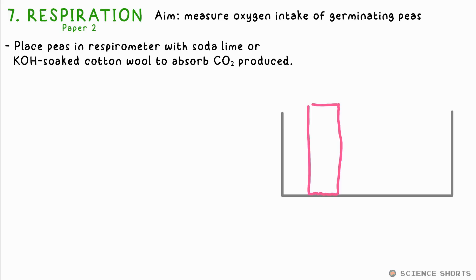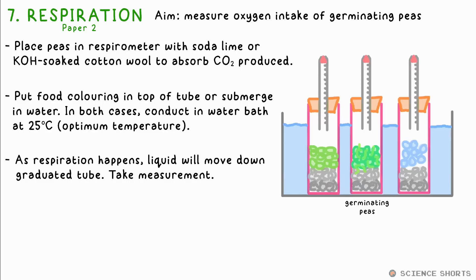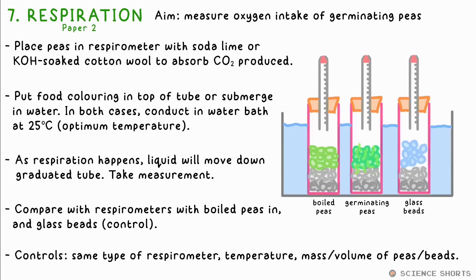Biology 7: respiration. We use a respirometer to measure the rate at which oxygen is absorbed by germinating peas. The tube has a small opening at the end to allow the pressure to equilibrate. A drop of food colouring is inserted in the end, which will move down the tube as the pressure decreases inside. Alternatively, the tubes could be submerged in water. Either way, the liquid will move down the graduated tube due to oxygen being absorbed by the peas, and the carbon dioxide produced being absorbed into the soda lime. You can also use cotton wool dipped in potassium hydroxide solution. It's best to put these in a water bath at 25°C for, say, 30 minutes, as this is the optimum temperature for respiration in the peas. You can then compare the result against two other respirometers under the same conditions — one with boiled peas in, and another with just glass beads in as a control.